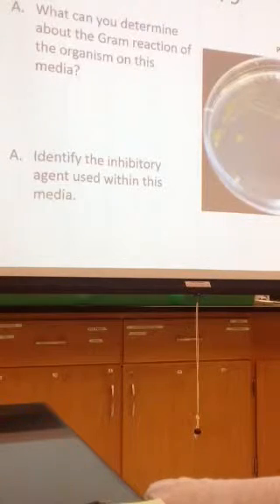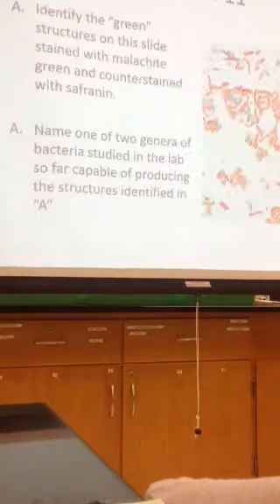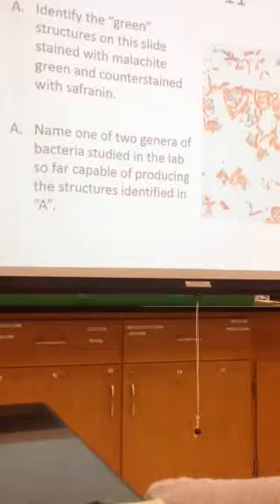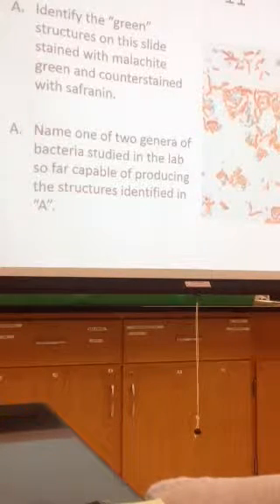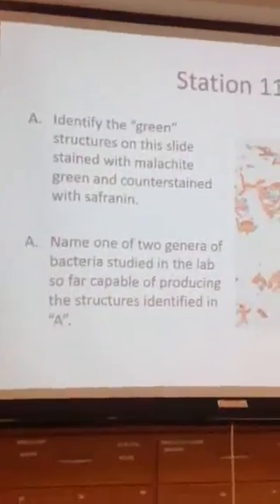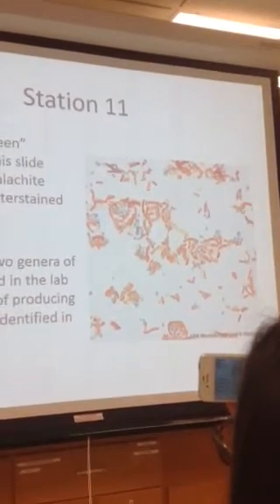Okay, you don't have to worry about PEA. We don't do this one, and we don't do catalase yet. This one we do. We have done. What are the green structures on this slide? Those are spores. Don't they look pretty? I did the spore stain. I know. I'm awful proud of it. Okay.